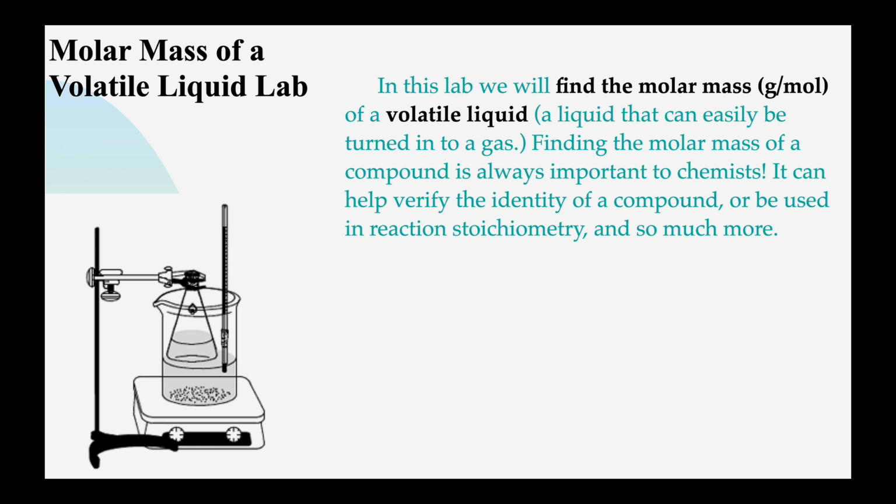Finding the molar mass is always important to chemists, all right? We need that for, say, stoichiometry, for turning grams to moles. If you have some kind of solution stoichiometry, sometimes it'll be helpful to find out how much mass is in your solution. Lots of different reasons why finding molar mass is important. So this is a cool kind of technique to have.